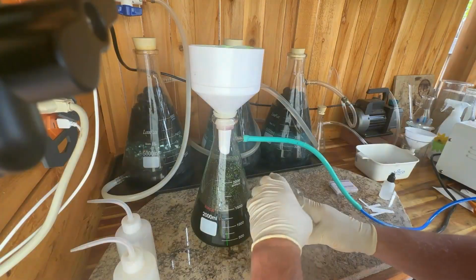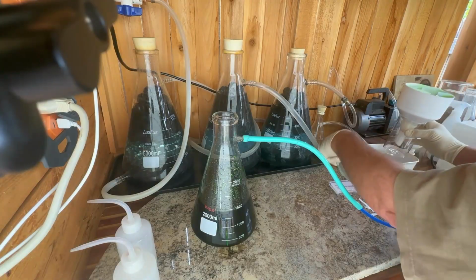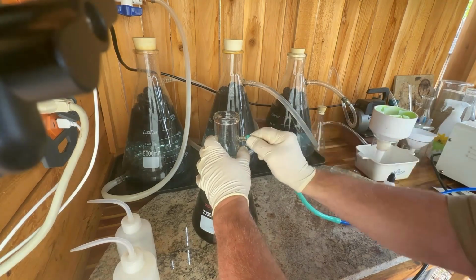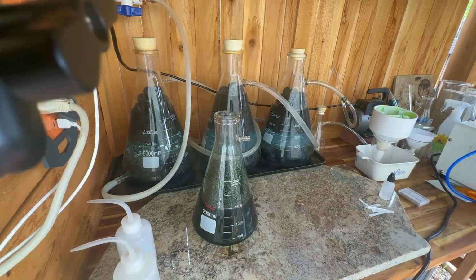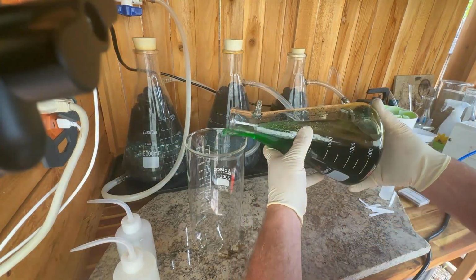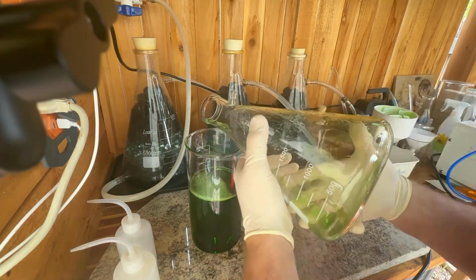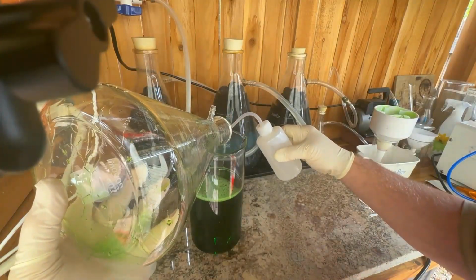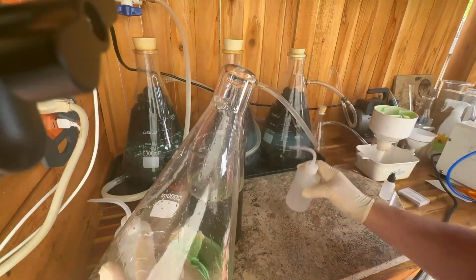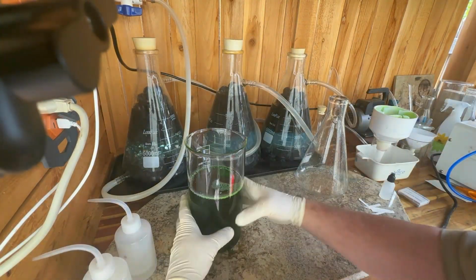So filtering's done. We're going to go ahead and take this down and put this into a beaker. While I'm getting that set up, I just want to go over these waste materials. Normally when I process, I evaporate my waste down significantly. This should have been completely barren, tested barren. Gold had dropped, copper had been in it. As it concentrated, it started to behave a little differently, so I gave it a test, and it started to test slightly positive. I reduced the rest of it down and just mixed these two together. I figured it's going to be dirty and ugly no matter what, but that's where we are.